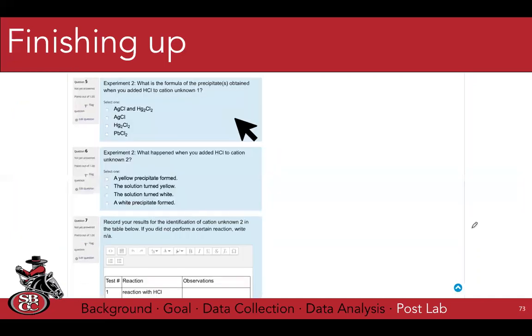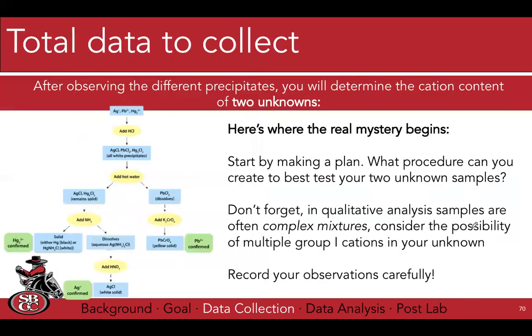Would a possibility be with each unknown make 3? So you have to make 3 test tubes and, like, add HCl, then add the hot water, or do we need more than 3? Yeah, no, I think that's, well, there are only 3 cations, so I think 3 is a good number. And yeah, that's exactly the idea, is making sure.